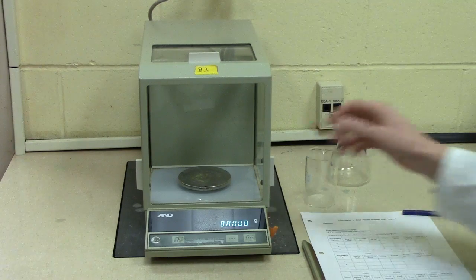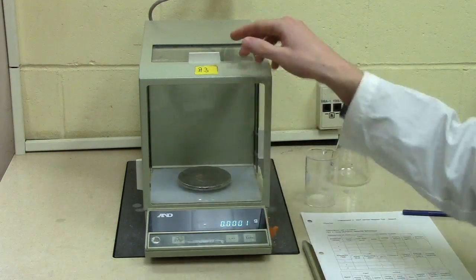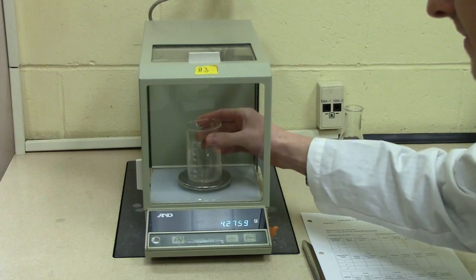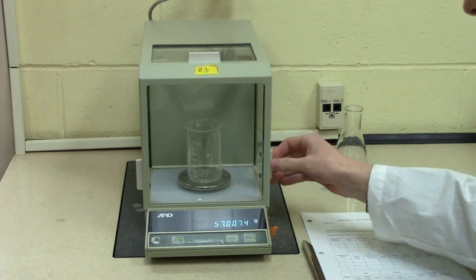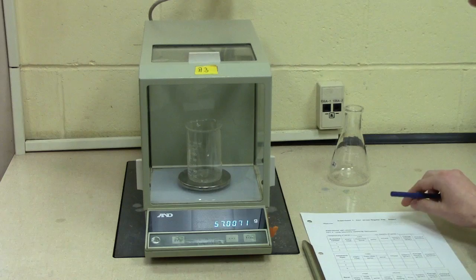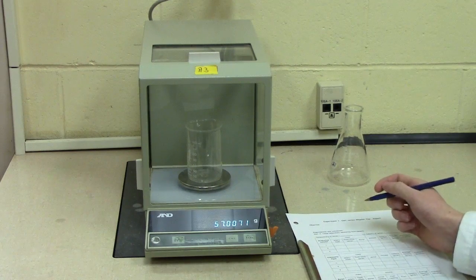Once you have your blank reading you can open up the doors either on the sides or the top of the balance and load in your empty beaker in this case. Closing the door you'll get a reading of what the mass of the beaker itself is. Make sure you record this as you'll be using it for weigh by difference.